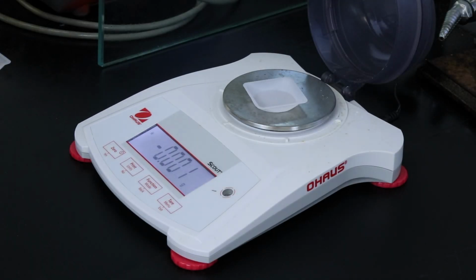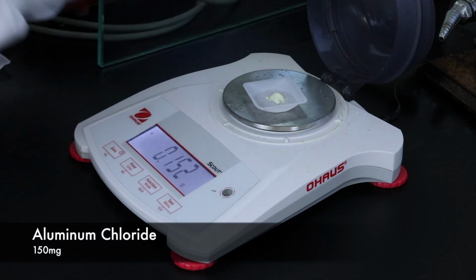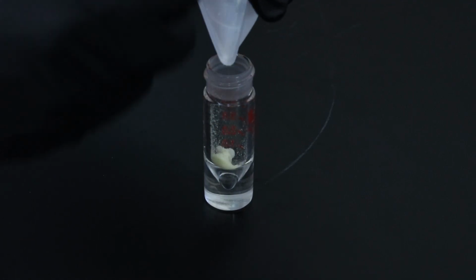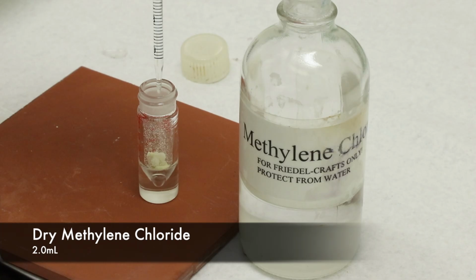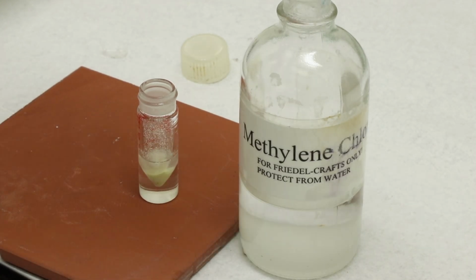I'll start by adding all of the reagents. So I'll weigh out 150 milligrams of aluminum chloride and add that to a 5 milliliter conical vial containing a large spin vane. Then I'll add 2 milliliters of methylene chloride that has been dried over sodium sulfate and left in the hood to make sure that there's no water contamination.